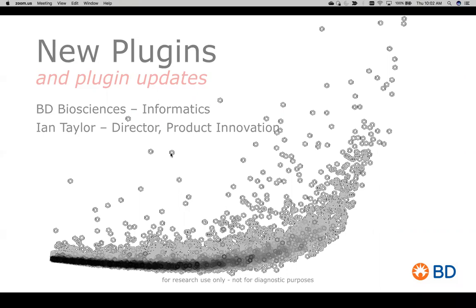We've got a pretty good group of people joining today, so I want to thank you all for taking the time. And without further ado, I'm going to jump into the slide deck. Again, just remember to stick around after the presentation. I'm going to actually try and analyze some data live using many of the plugins that we're going to discuss within FlowJo right after this little update on the plugins that we have out currently and some of the newer features that are available there.